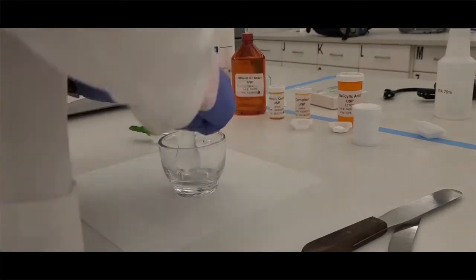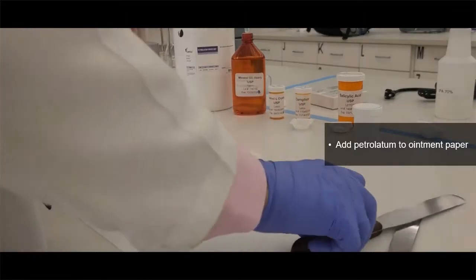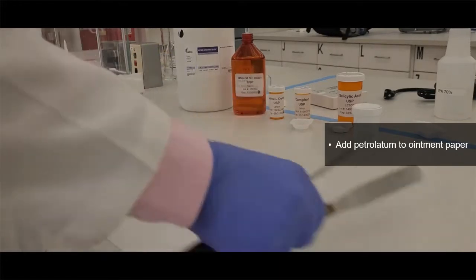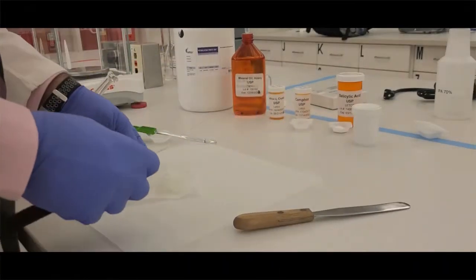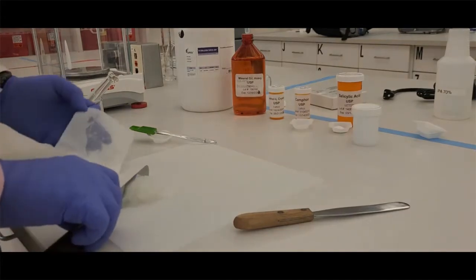Once that is done, the next thing that I will do is I will weigh out my ointment, my petrolatum. That's going to be on an ointment pad. I'm going to use a spatula. There's two different spatula sizes. I'm going to use the bigger size here. I'm going to use that to scrape off my white petrolatum from the white paper.